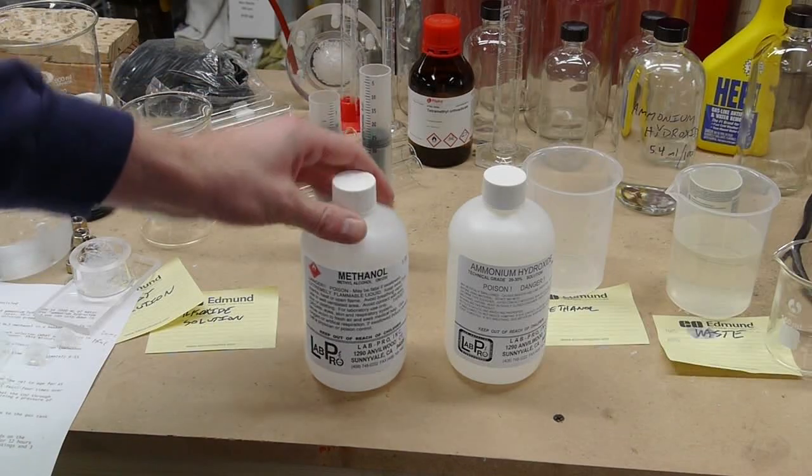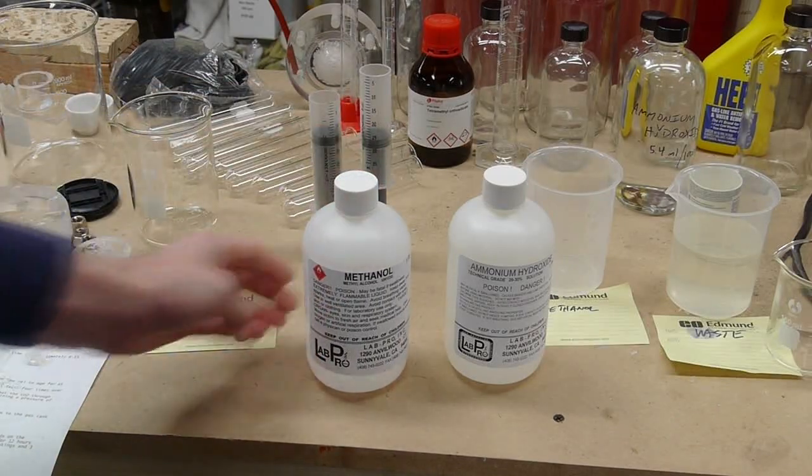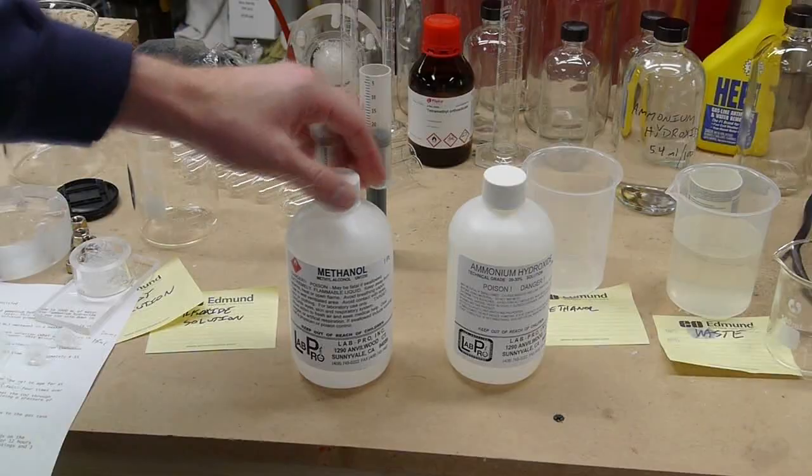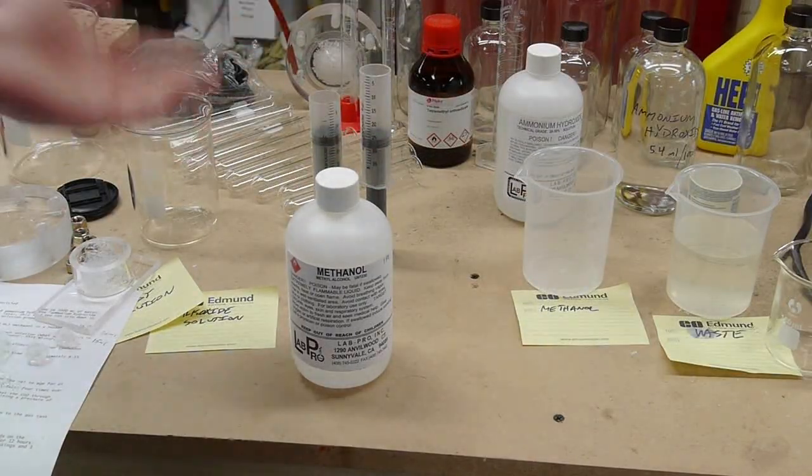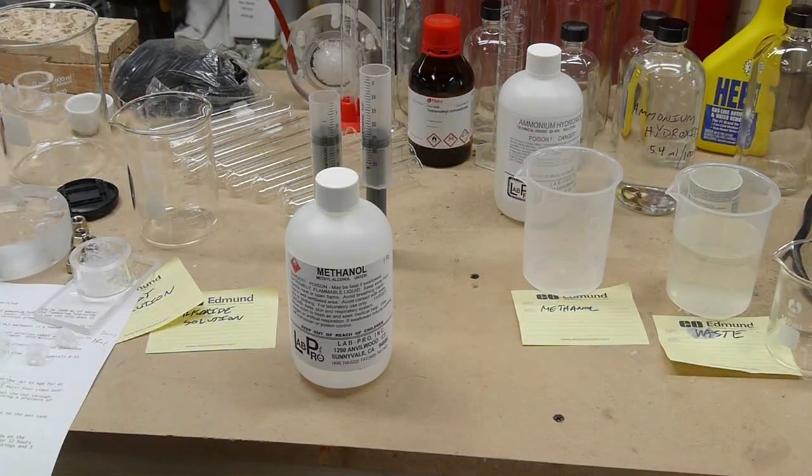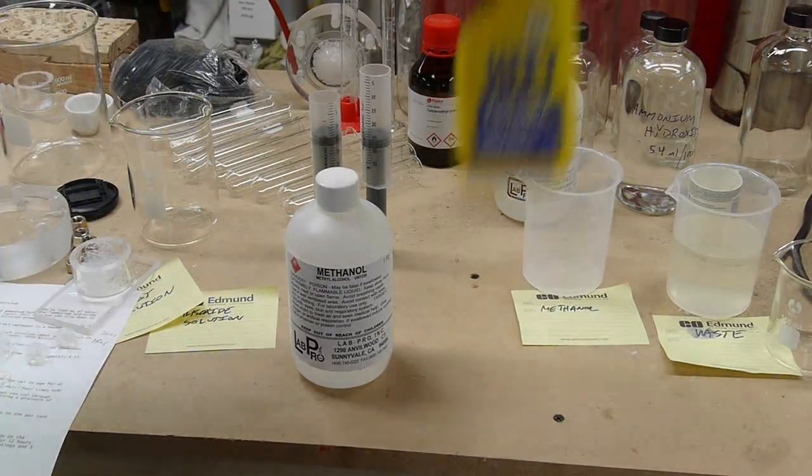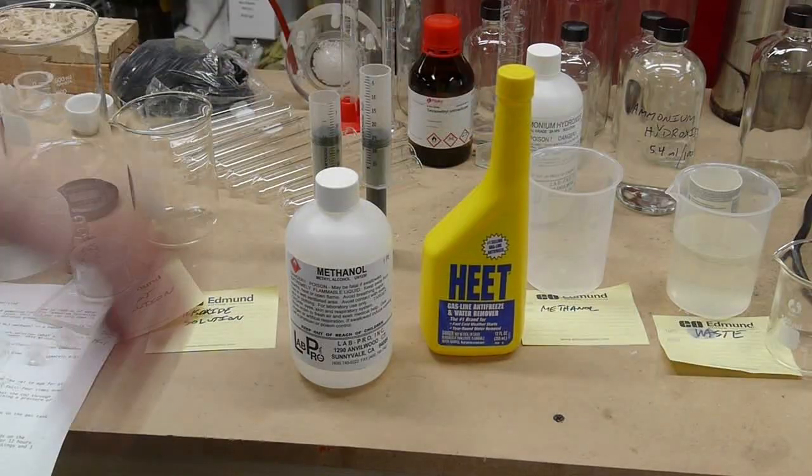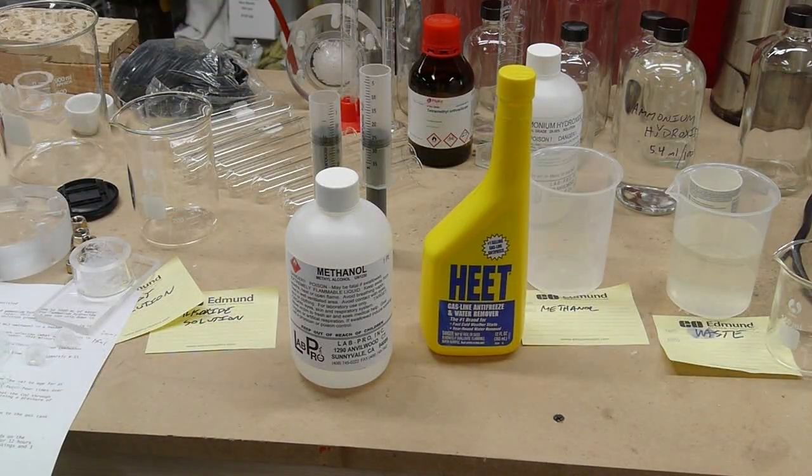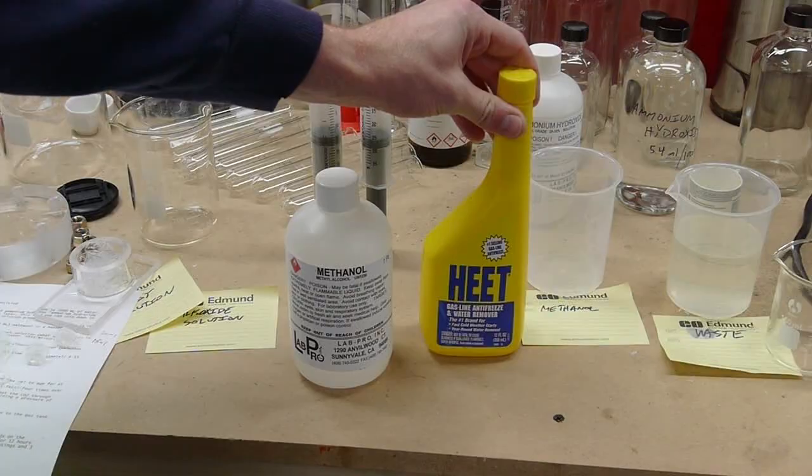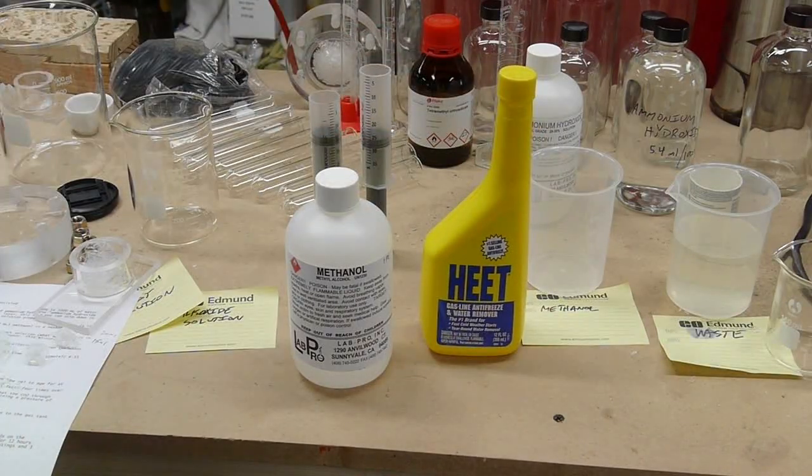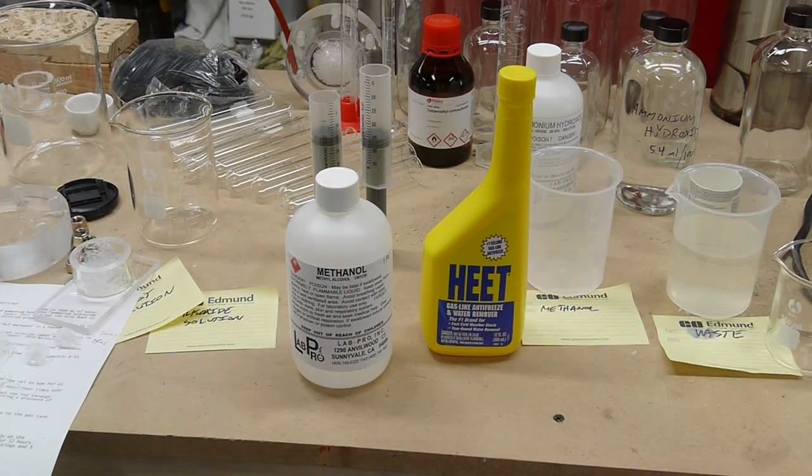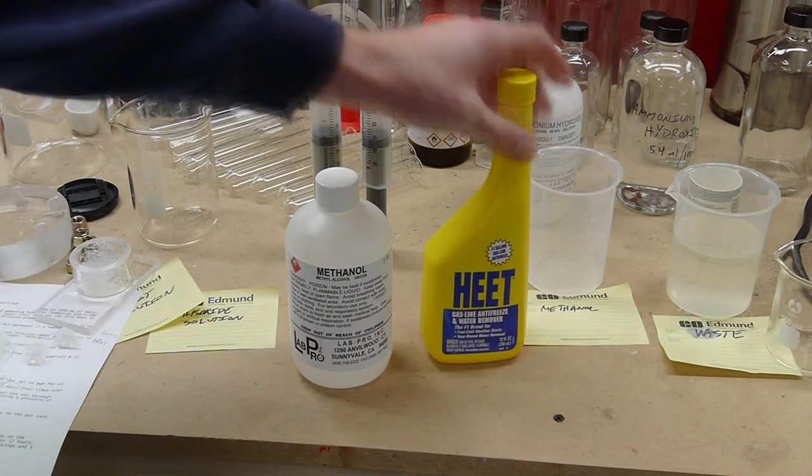I bought some technical grade methanol also from LabPro, but started to run low on it. And since you need, you end up needing quite a bit of methanol to make aerogel since you're constantly changing the solvent. So a cheaper source of methanol is this HEET gas line antifreeze. This is more or less pure methanol. I think there's a couple of ingredients that they aren't telling us about. If you read the back, it says there's some other kind of additive, but it's very almost pure methanol. And so I use this for a lot of the solvent exchanges.